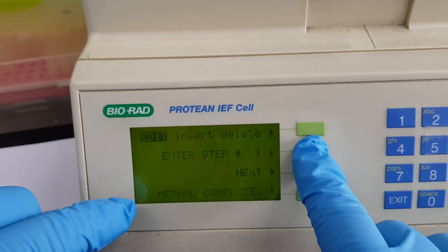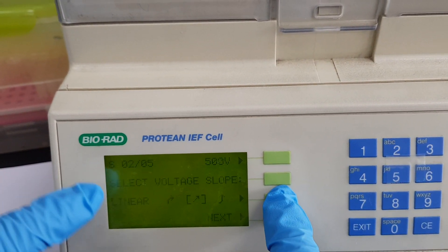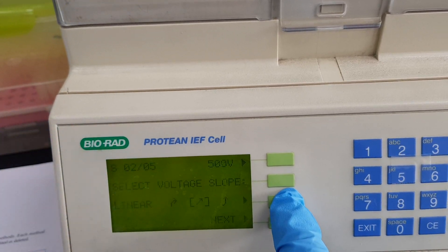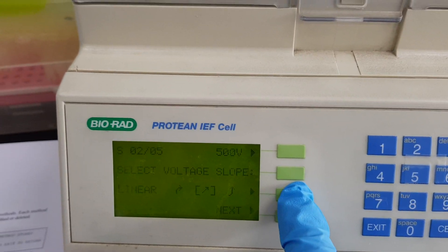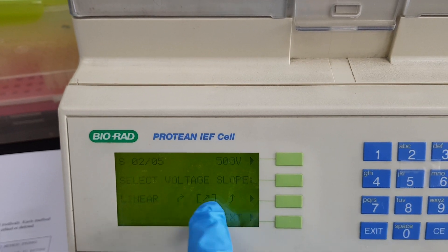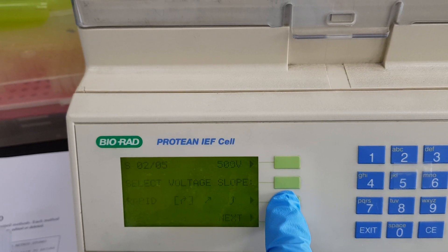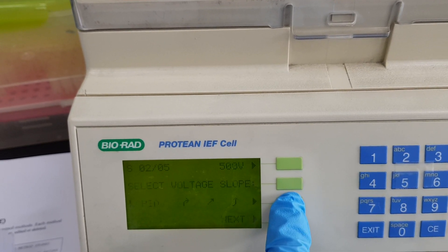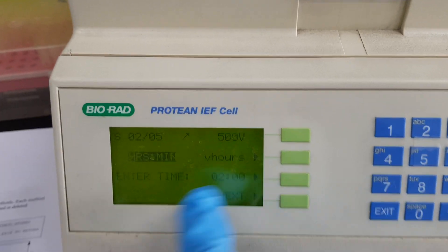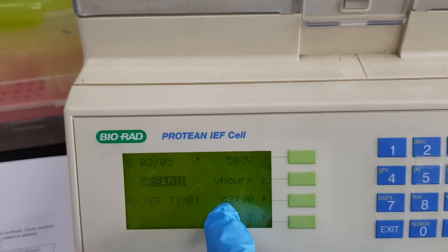Now I will enter step number two. The display shows two out of five. My second step is 500 volt. It is showing voltage options: slow, linear, and rapid — I will select the linear voltage for 500 volt.